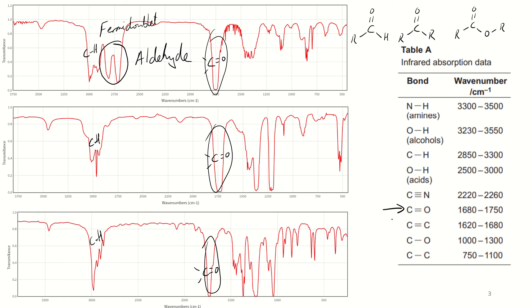Now spotting between the other two, what we're essentially relying on is trying to spot this C single bond O. There is a tiny difference between where the carbonyl peak would appear, but because it's such a range, it's not really a good way of doing it by eye. And the annoying thing about the C single bond O is it's down in the fingerprint region. So again, this isn't really very useful to us. It's quite hard to spot. You would normally use a better instrument than IR for distinguishing between these. So stick them in a proton NMR, for example.